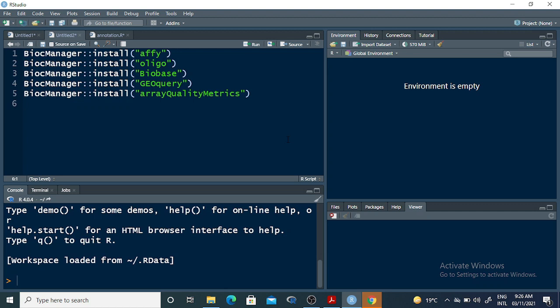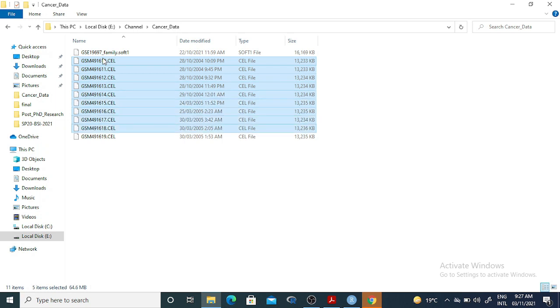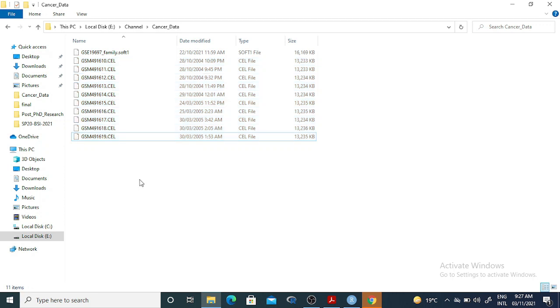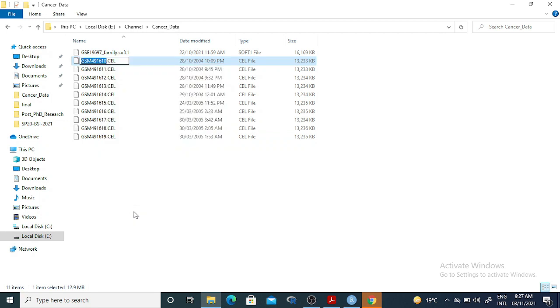The dataset — if I just show you here — I have downloaded some part of the microarray data, and these are ten samples. Each sample has a GSM ID, and the file extension .cel is for the Affymetrix microarray platform. I have downloaded this from the GEO database.